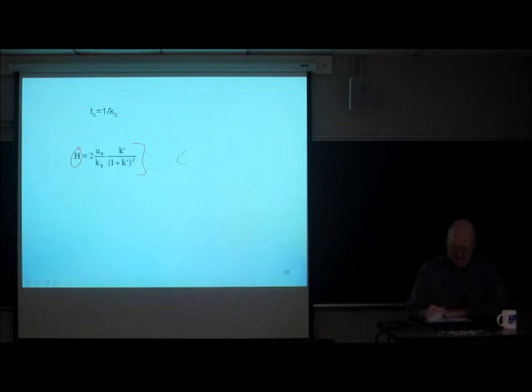So this is your C term. And you can see that if we increase the velocity, the h gets bigger, more broadening. If we decrease the rate constant, the h gets bigger, more broadening. And it's k prime dependent.